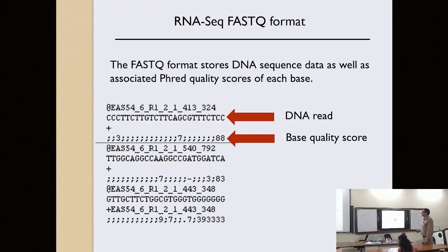Okay, so RNA-seq data are provided in FASTQ format. So there are files, and these are very large files. I have actually the workflow that one of my PhD students provided to me, so that I give that to you. And I think you have got the PowerPoint for that.